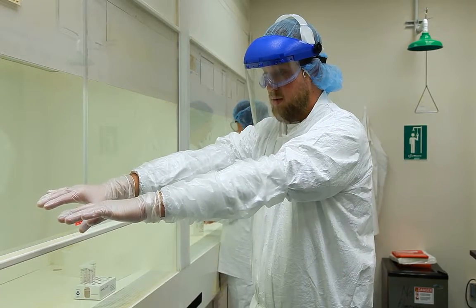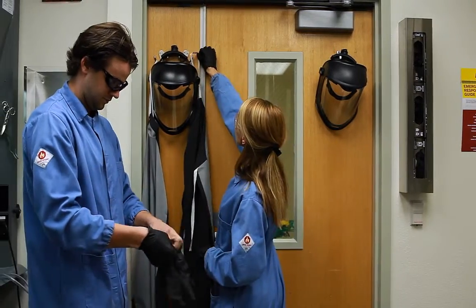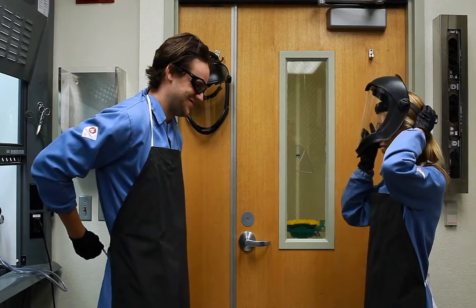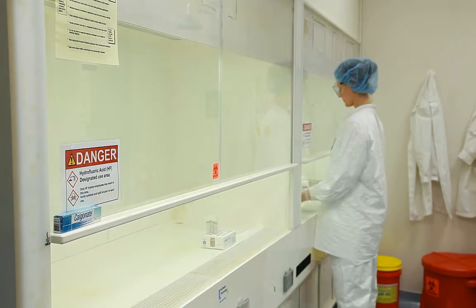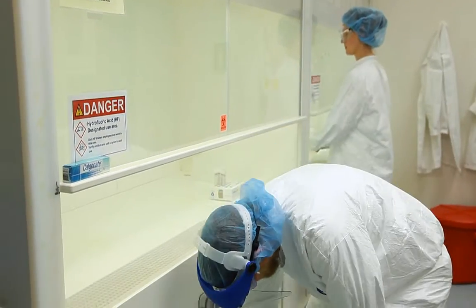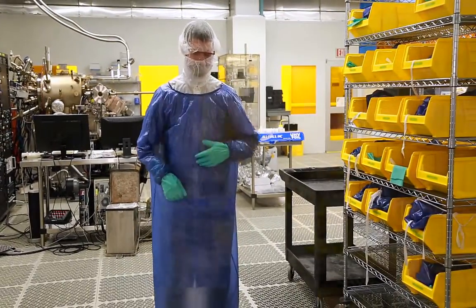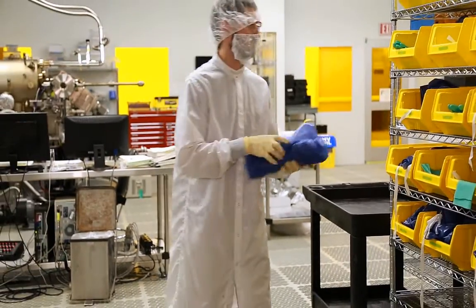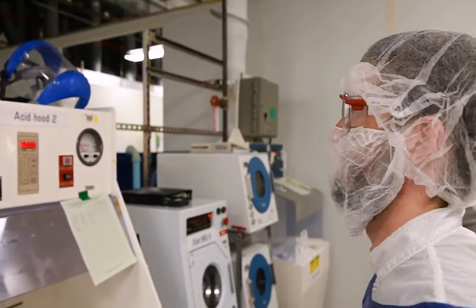If you must reach within the hood, make sure beforehand that your PPE sufficiently covers your arms and wrists when extended. Prior to entering the lab, make sure you are wearing full length pants and closed toe shoes. Once in the lab, don the appropriate PPE beginning with your initial set of gloves, eye protection, and face shield. A clean room gown may be substituted for a lab coat. Either can be worn under an acid resistant apron if there is potential for an HF splash. Your supervisor may perform a PPE assessment for handling HF in your labs, which may exceed the minimum approved ASU PPE. A face shield is required even when working within a fume hood.